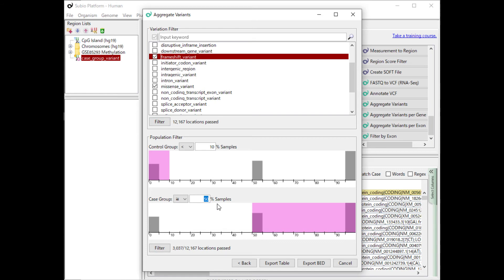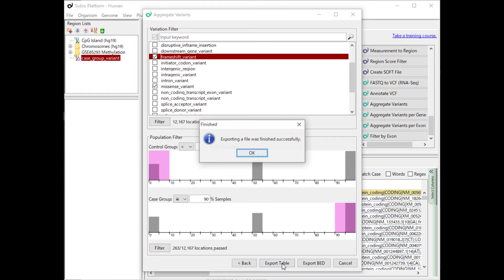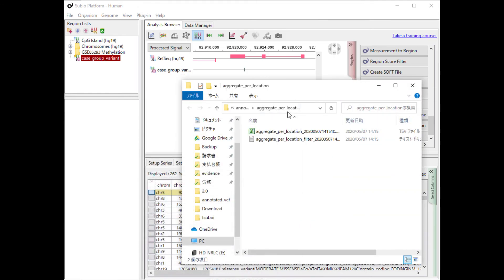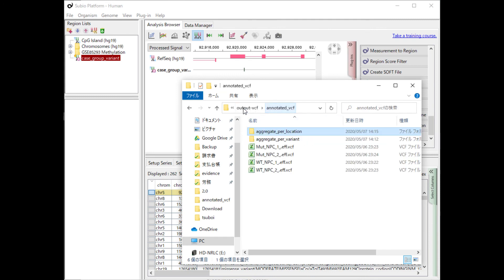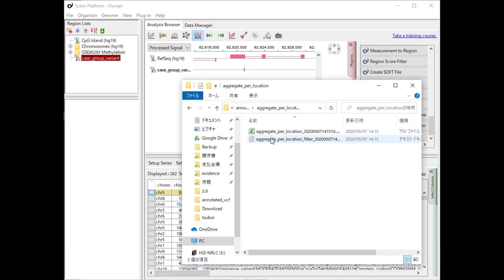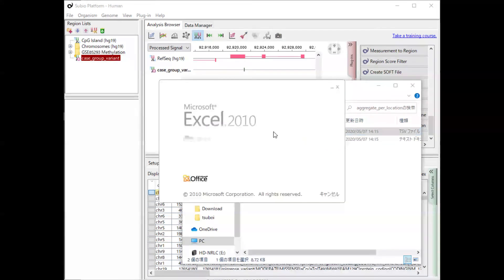Set the population filter to the same settings as before, and run the export table. The results are output to the same location, under the folder named Aggregate Per Location.